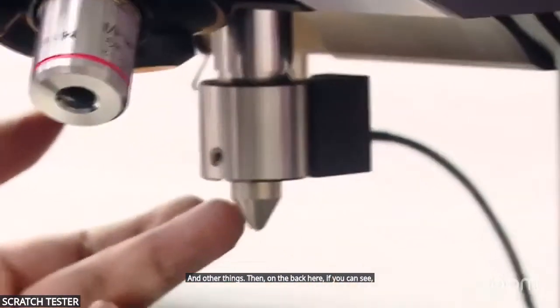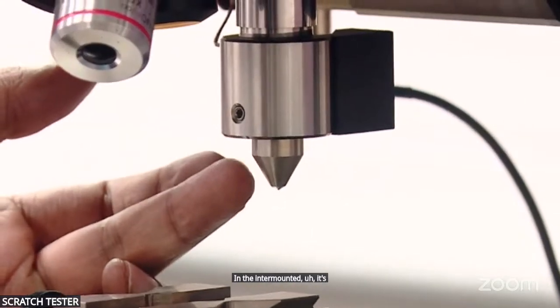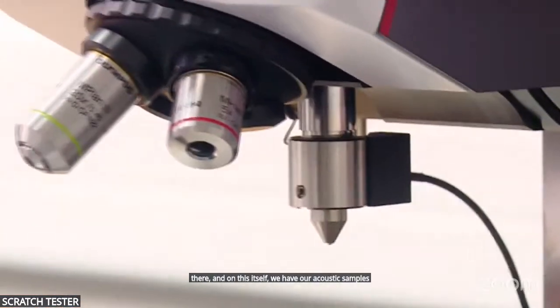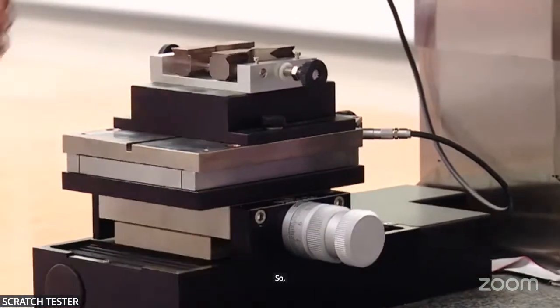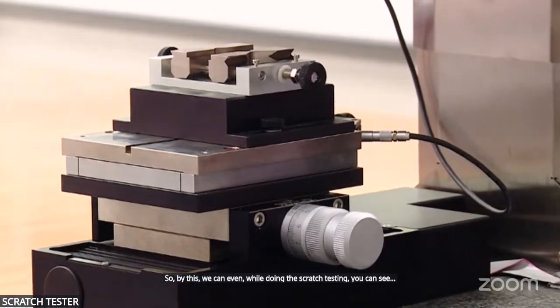Then on the back here, if you can see, we have this Rockwell indenter mounted. It's 200 micron, right? Yeah, 200 micron diameter, and on this itself we have our acoustic sensor. From below, if you can see this cable coming, this is related to our friction module. So by this, even while doing the scratch testing, we have a friction sensor.